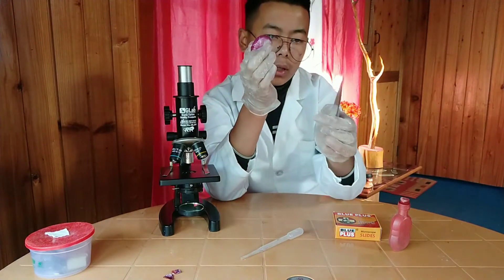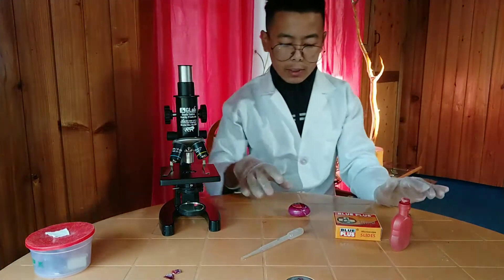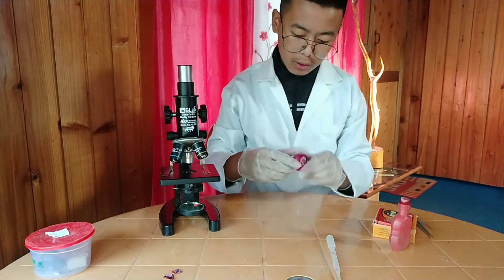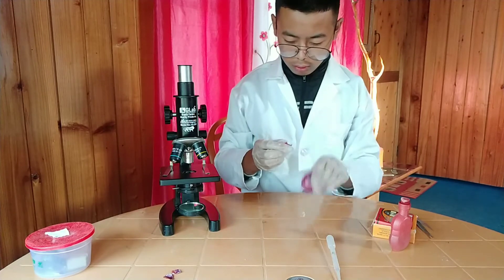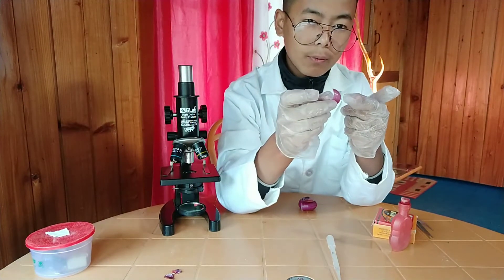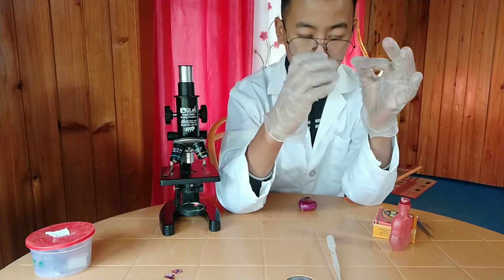I have put a 15x eyepiece in the compound microscope with 10x resolution and magnification. Firstly, take a single peel of an onion just like this. This is the outer part which is purple in color and this is the inner part which is white in color.